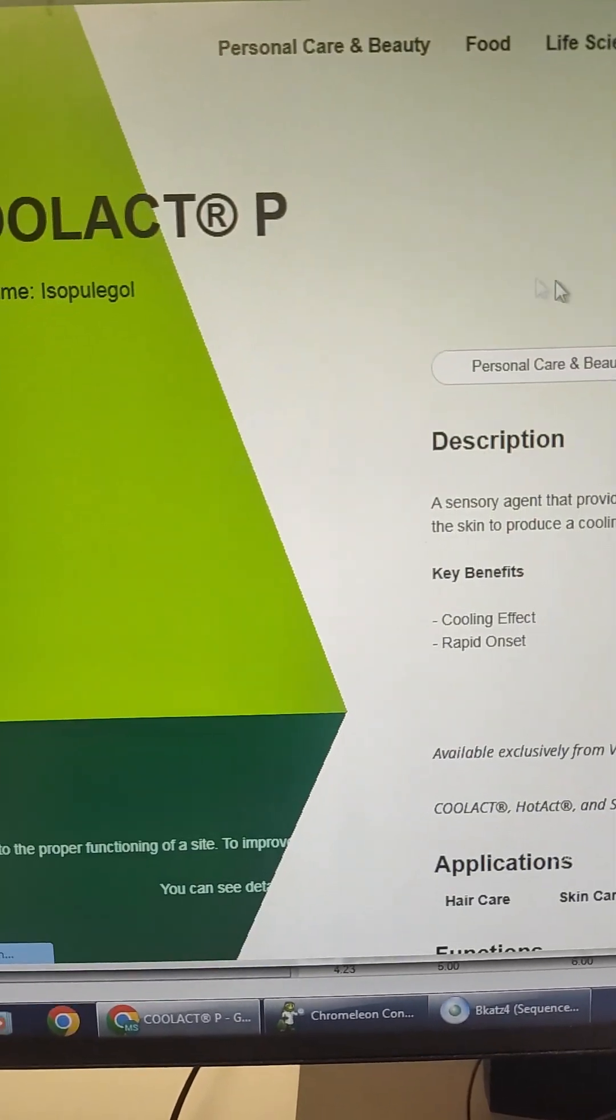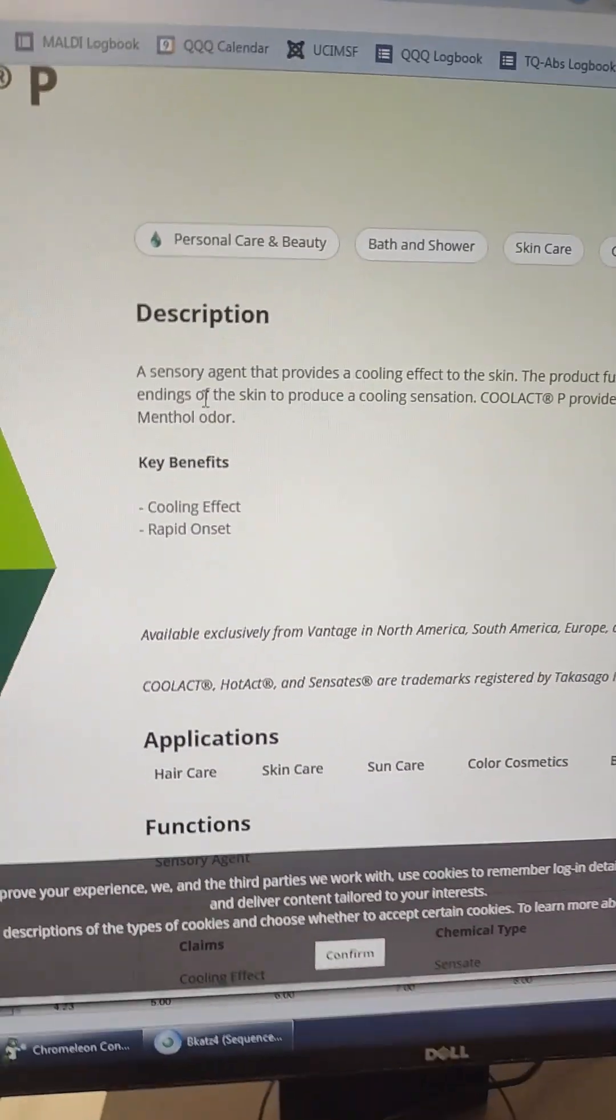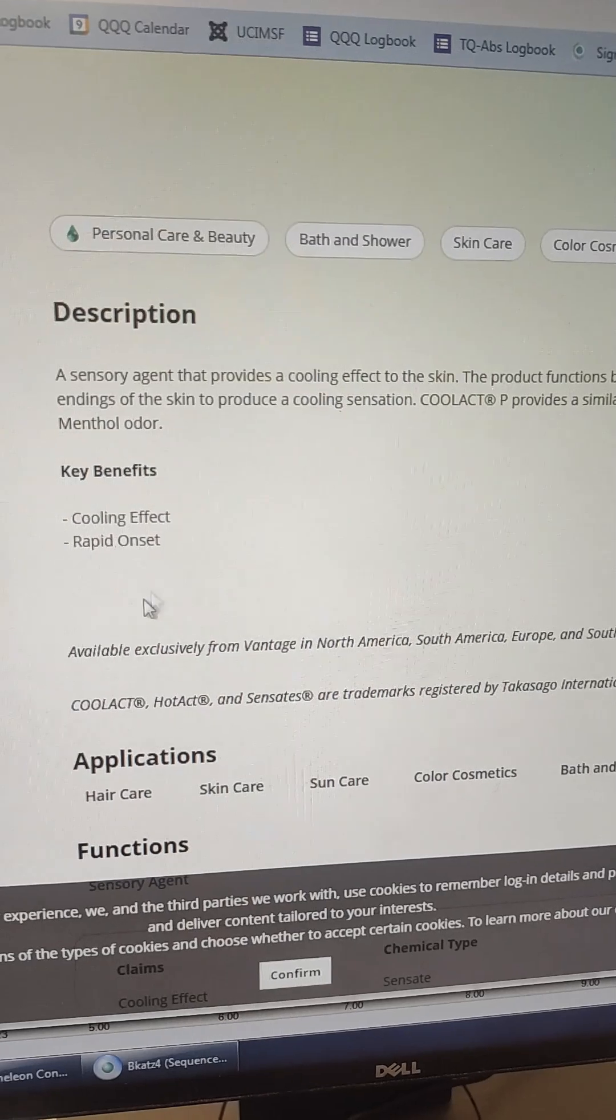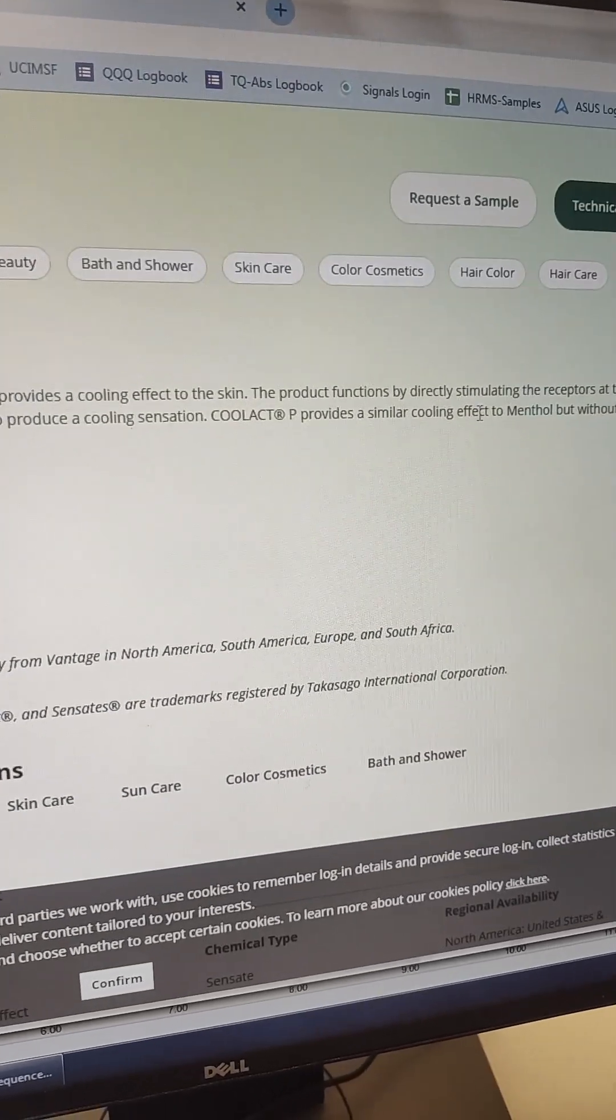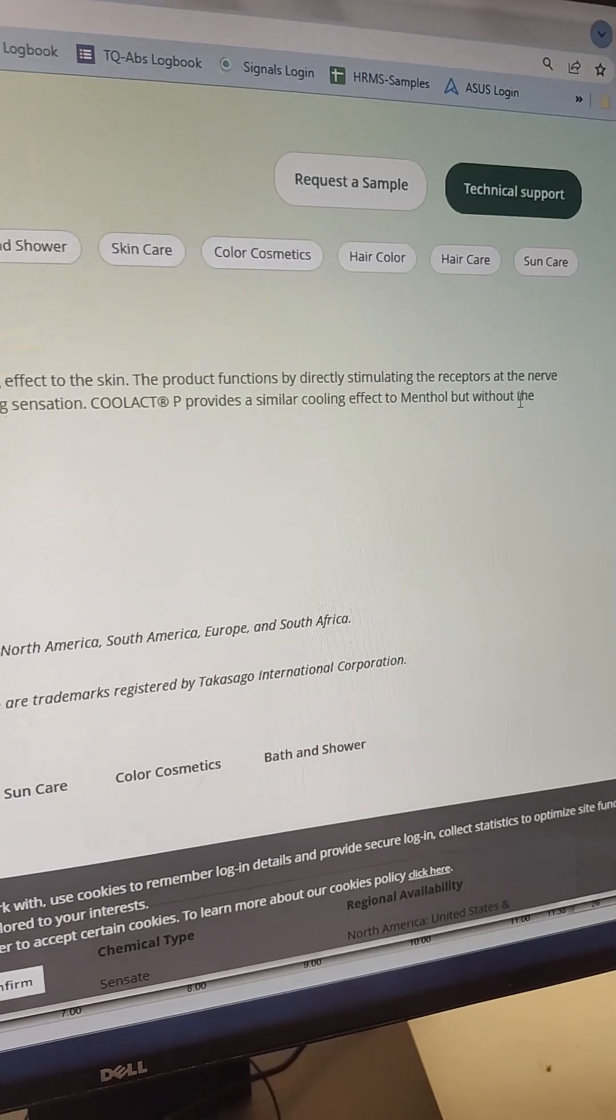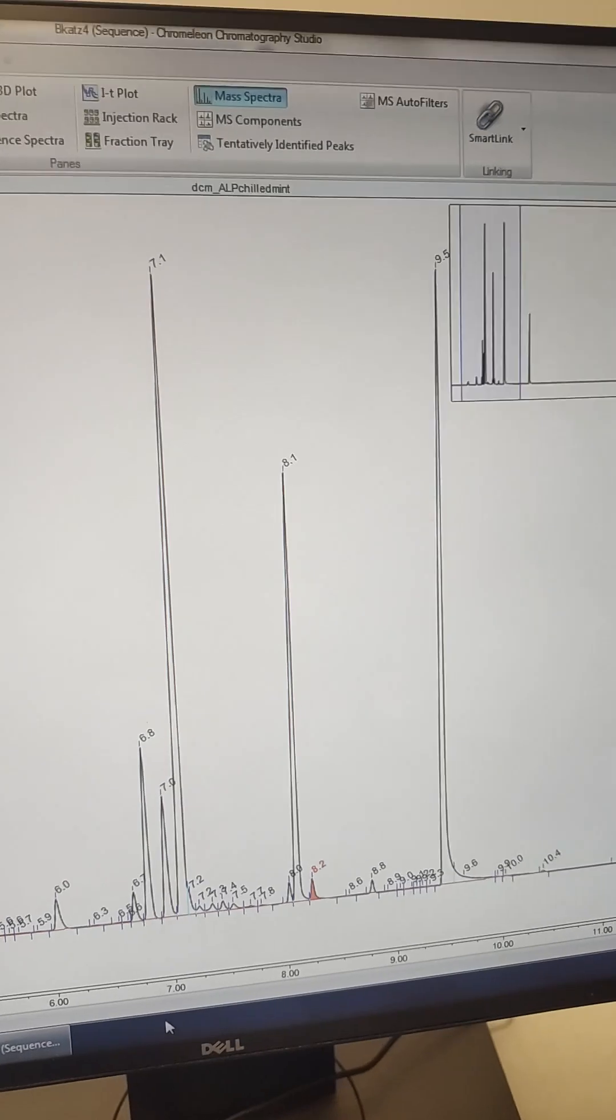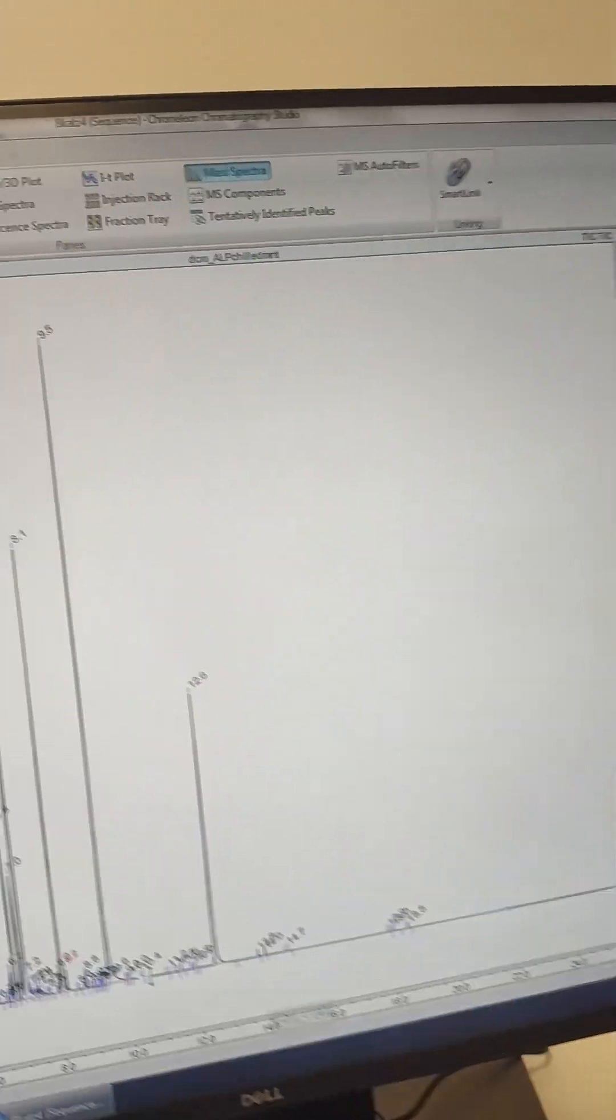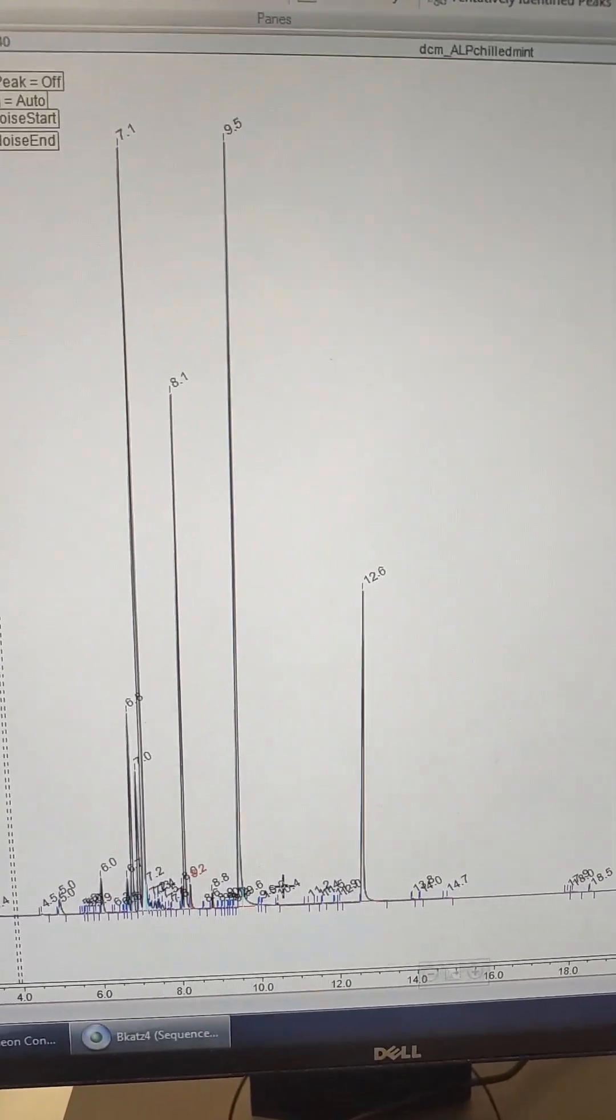From maybe Vantage Specialty Chemicals, and it has a rapid onset cooling effect. Rapid onset cooling effect, Cool Act P or Hot Act provides a cooling sensation similar to menthol but without the menthol odor. So yep, it's minty, it's cooling, I guess that's why they call it the Coolament. There's your ALP data. I'll run some more of the flavors when I get them.